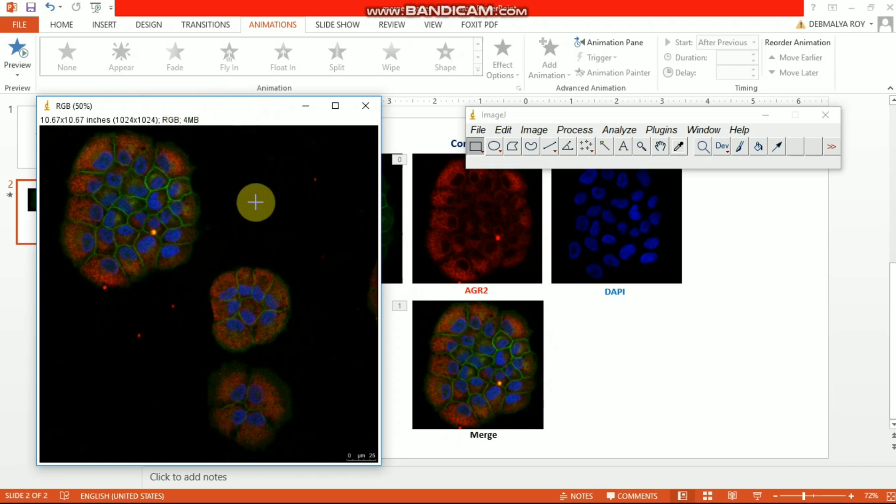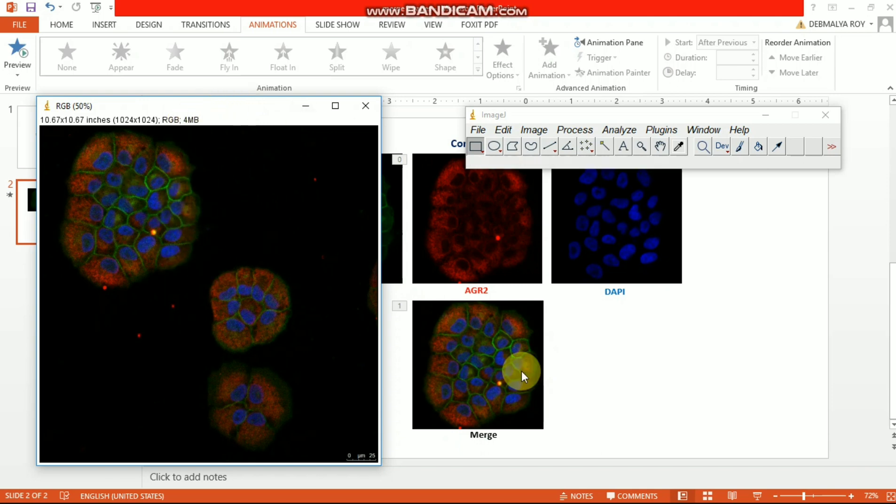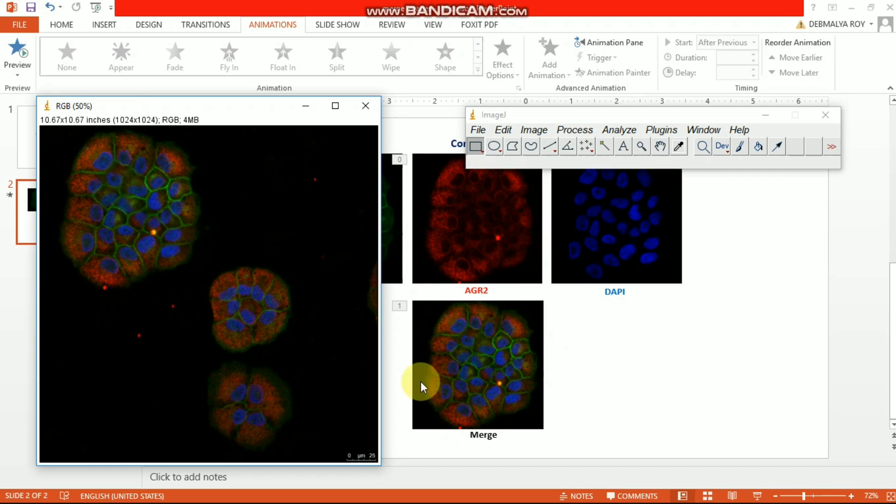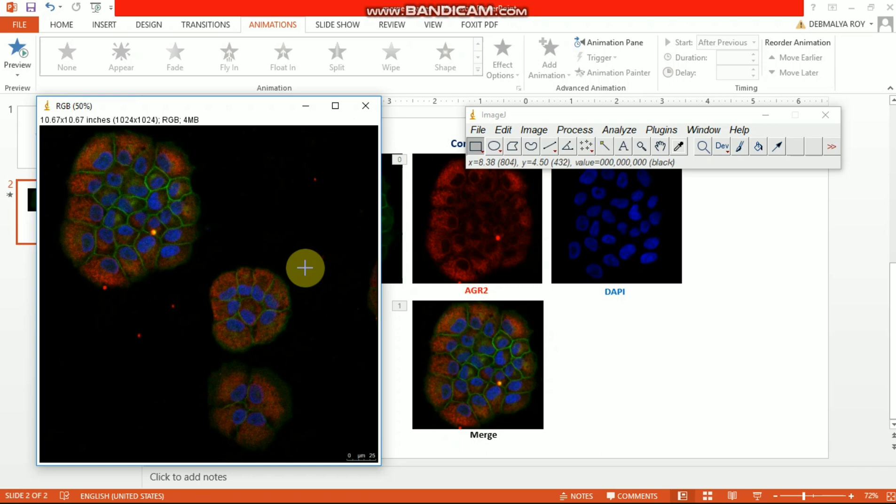And this one that I showed before in the PowerPoint, that is the merged one using the confocal imaging software. You can see that it's completely similar. There is no difference between these two images. So I think this ImageJ technique is pretty useful in many cases. You can use it alternatively if you don't have access to your software.